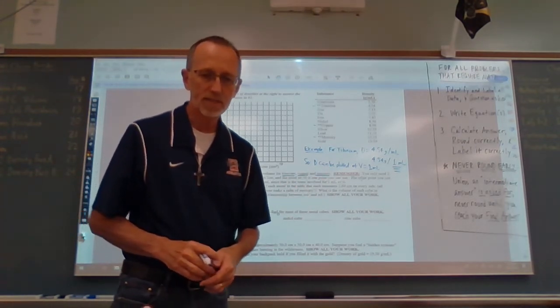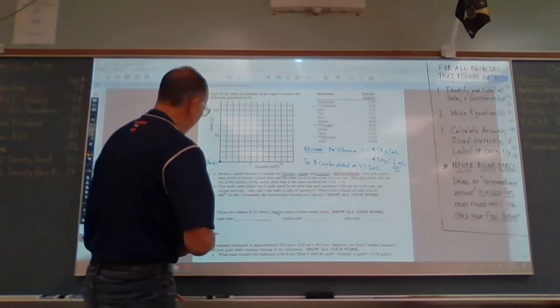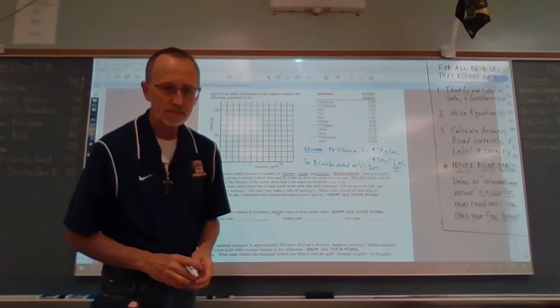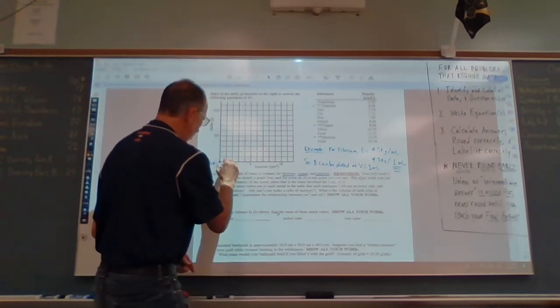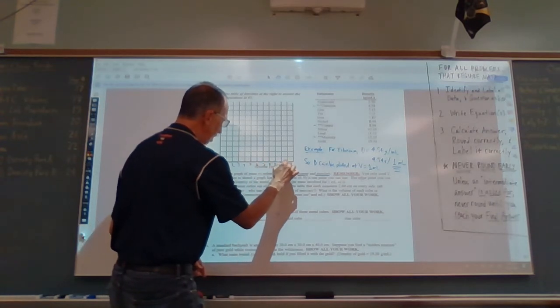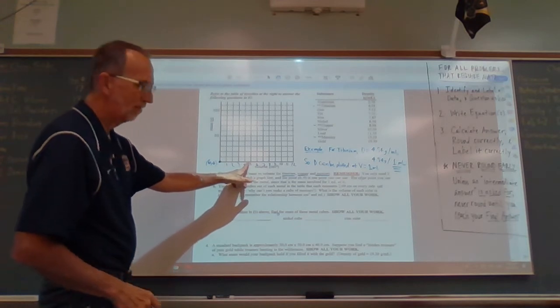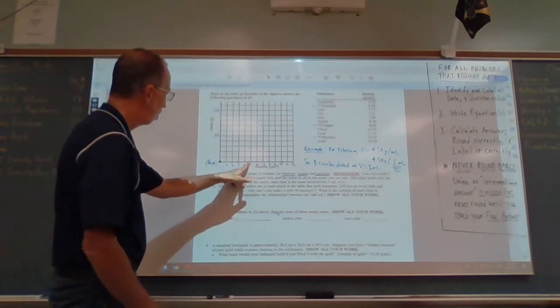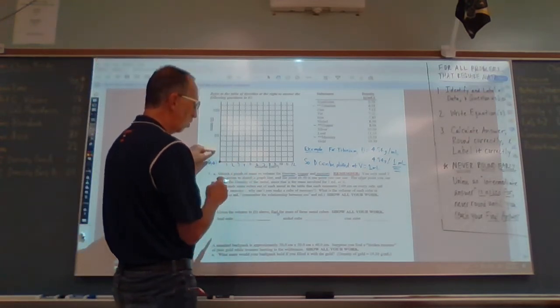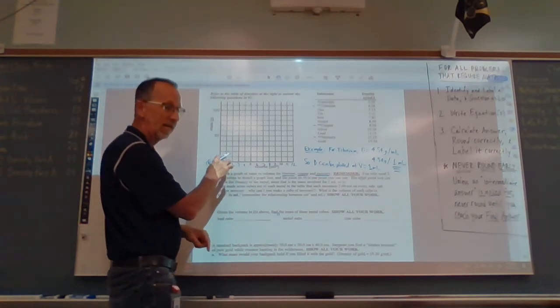All right? So let's do that for these 3. So titanium is 4.54. Well, here's 1, 2, 3, 4, 6, 7, 8, 9, 11, 12. All right? So 4.54 is about halfway there, and that's at, I'm sorry, we're going up here, my bad. This is volume. So the volume's 1 ml right here.